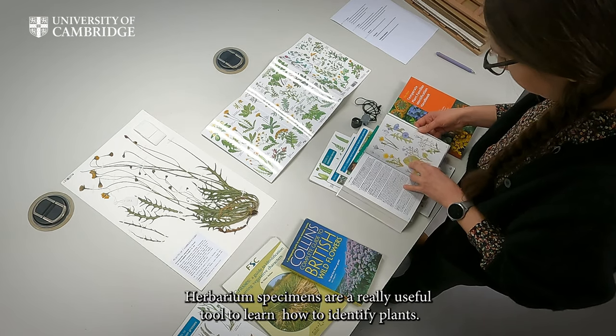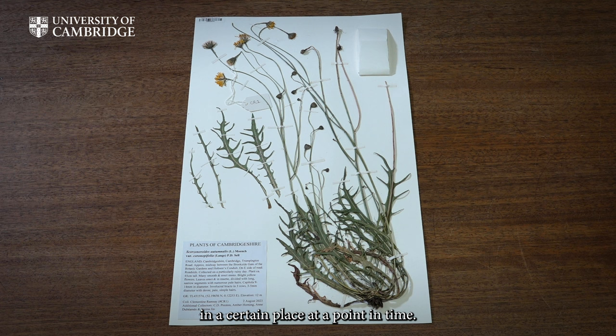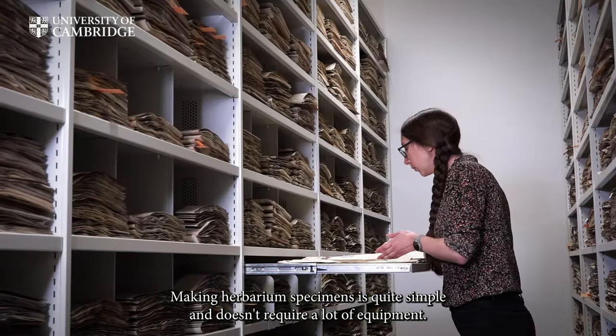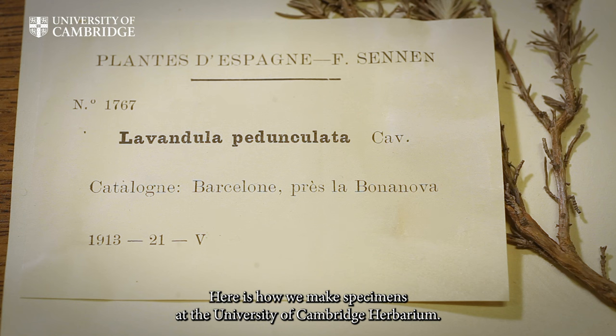Herbarium specimens are a really useful tool to learn how to identify plants. They're also a great way to keep a record of plant diversity in a certain place at a point in time. Making herbarium specimens is quite simple and doesn't require a lot of equipment — it just takes a bit of time. Here is how we make specimens at the University of Cambridge Herbarium.